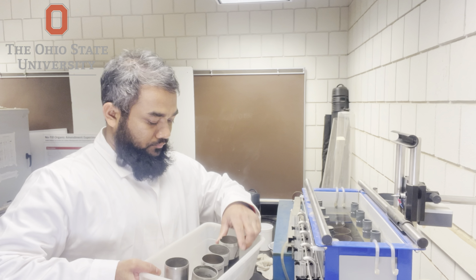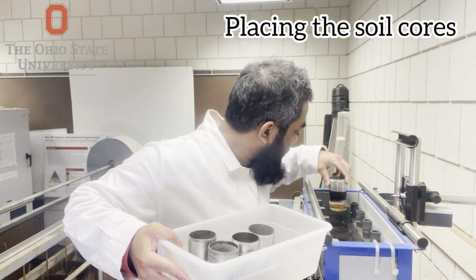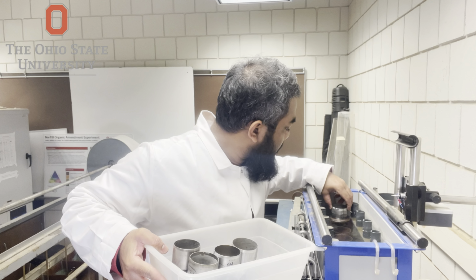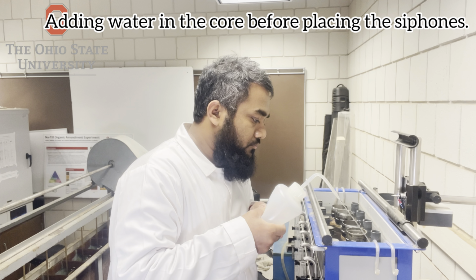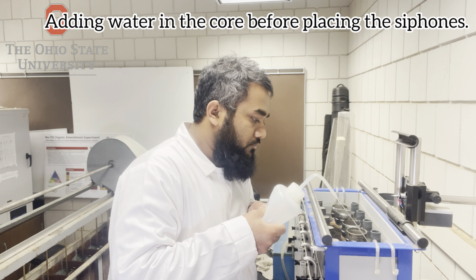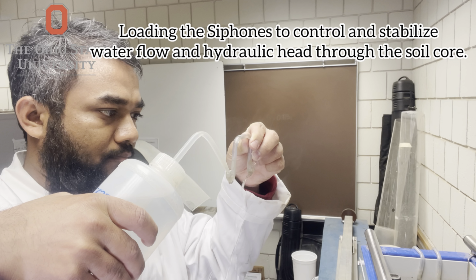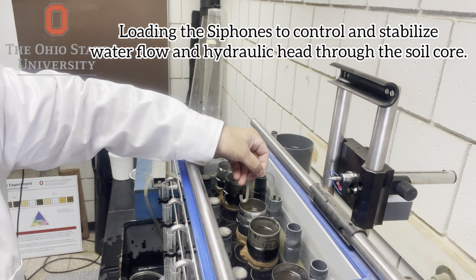Now let's talk about achieving steady state flow. Initially, flow may fluctuate. We will wait until the flow rate becomes constant over time. Successive volume measurements are similar, and thus we understand that it's the right time to take the measurement. Only after reaching the steady state, we will take the measurement. And then measuring the flow rate.